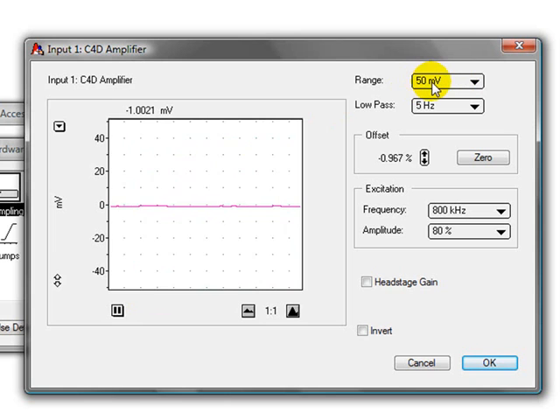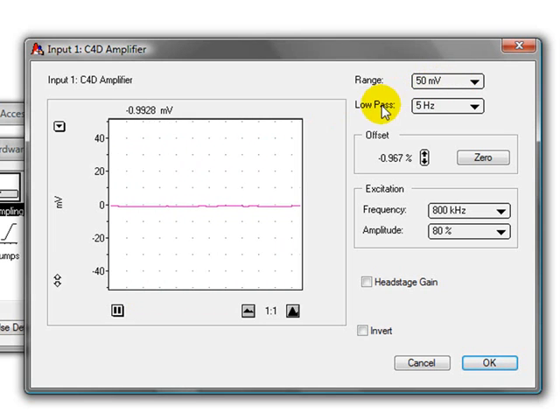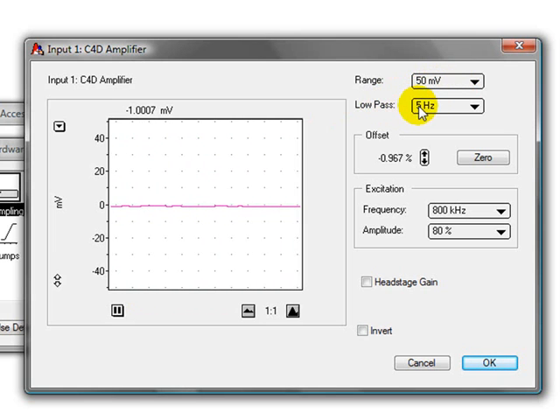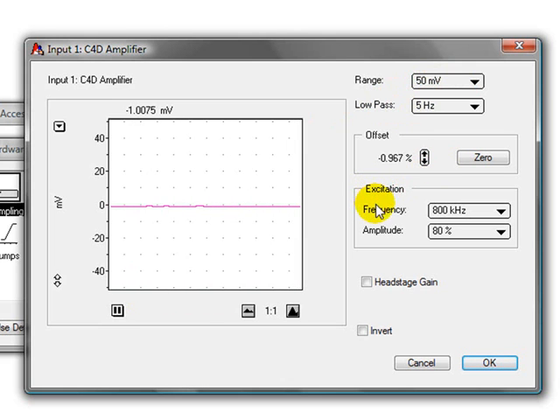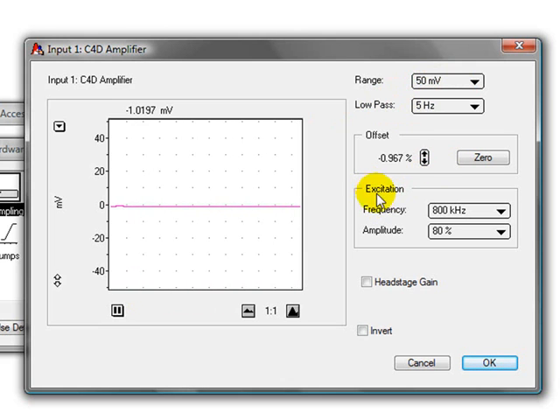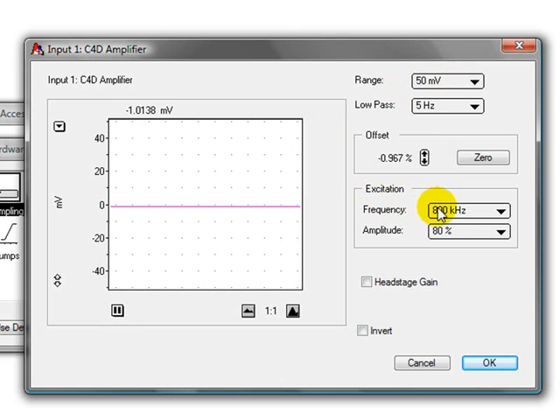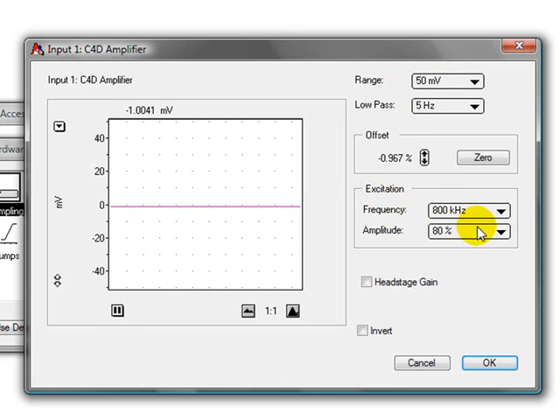Your range here should be 50mV. The low-pass filter should be 5Hz. And you enter the C4D excitation frequency, the amplitude, and whether the head stage gain is on or off.